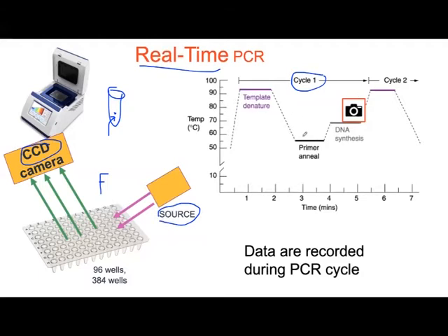So basically, while the PCR is run in the machine, you're going to collect data, and you can tell the machine, for example, to collect the data when the PCR ends, every cycle. So every cycle, it will measure the fluorescence intensity of this molecule at the end of each cycle. And by this, you're going to get data in real time. Now, I'm going to discuss in the webinar how this is utilized and how this is going to help you answer certain questions in molecular biology.